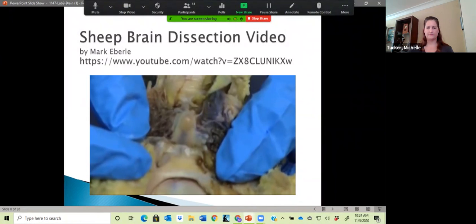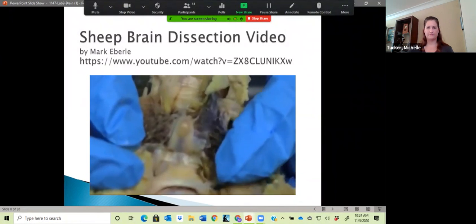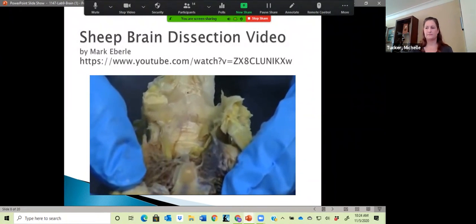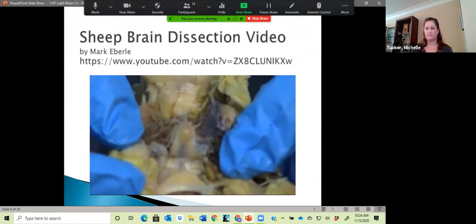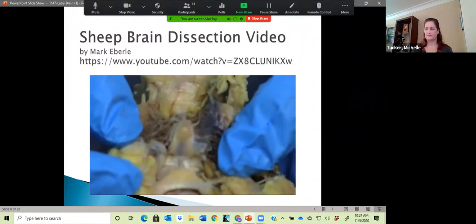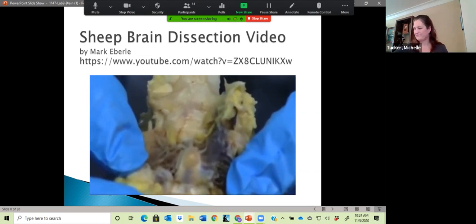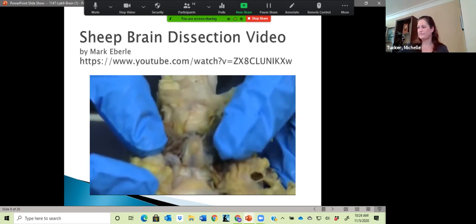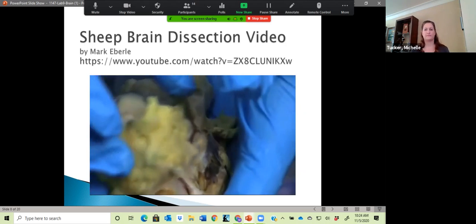And you'll want to take a look at it because it might be the only time you ever get to see a pituitary gland. Also, you might notice on each side of the pituitary gland are some very fine blood vessels, and they're a radiator to cool the sheep's brain. That's important because sheep don't sweat, and they have to have a different way of cooling the brain off. And they do it with these blood vessels that radiate heat that was taken out of the brain by the blood.